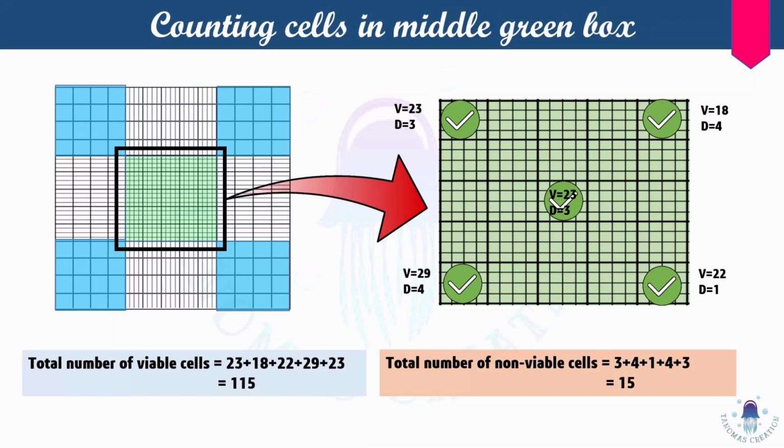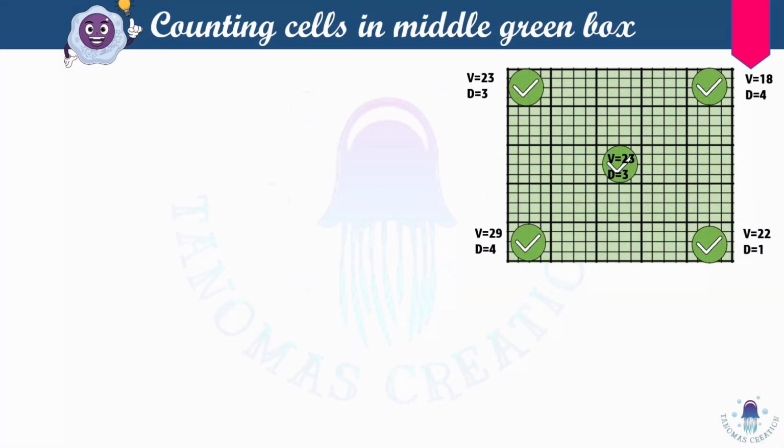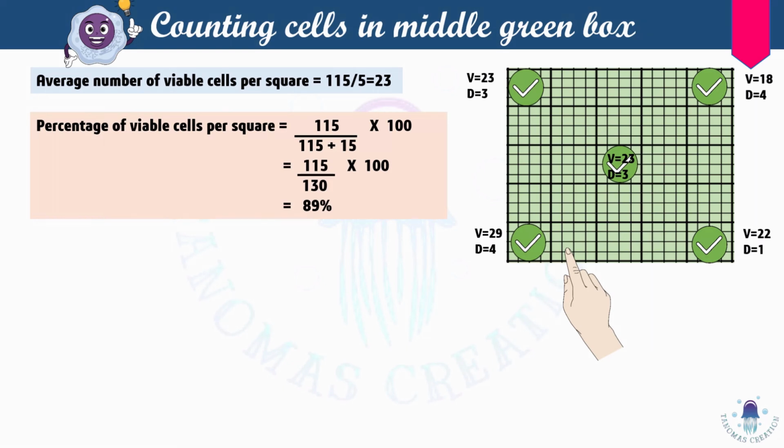Okay, now coming to the average number of viable cells in the same box. The average number of viable cells per square becomes total number of viable cells divided by the number of boxes counted. So 115 divided by 5 boxes counted, so divided by 5. So it gives 23. Now if we find out the percentage of viable cells per square, that is total number of viable cells divided by total number of cells into 100, which gives 115 divided by 130 into 100, that gives 89%. So here also we can say that there are 89% viable cells per square, right?